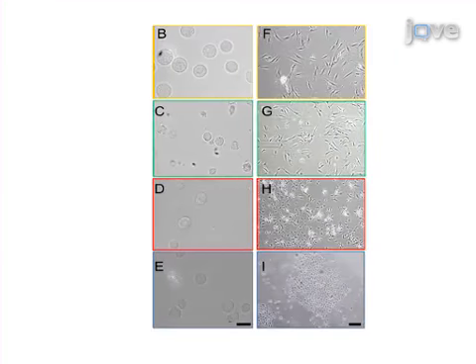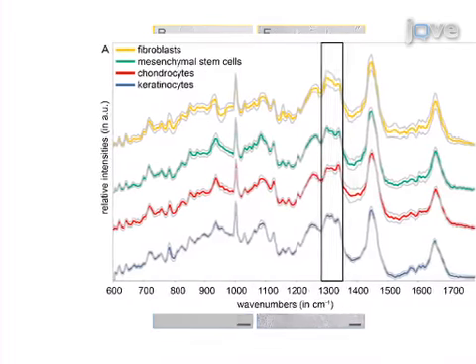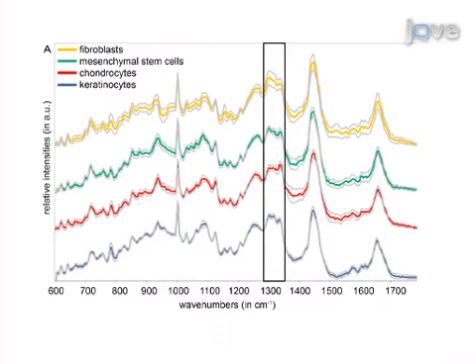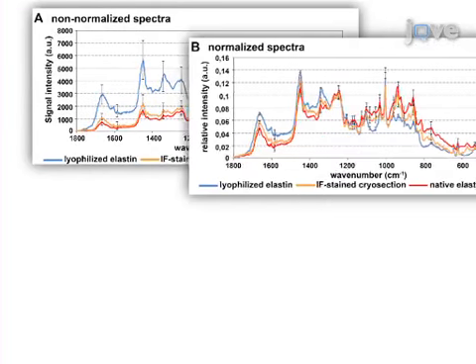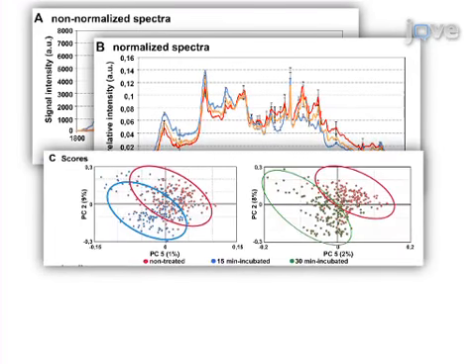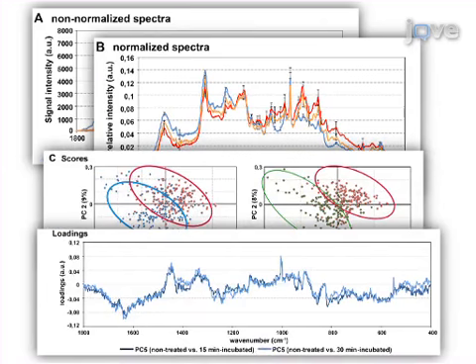Using a standard fluorescence microscope coupled to a Raman spectrometer, direct comparison of bright field and fluorescence images with Raman spectra is used to monitor numerous biological samples. Each chemical vibration is assigned to a specific Raman band, and the peak intensity is correlated with the amount of the present molecular bonds. Similarities and differences of the spectral datasets are detected by employing a multivariate analysis.